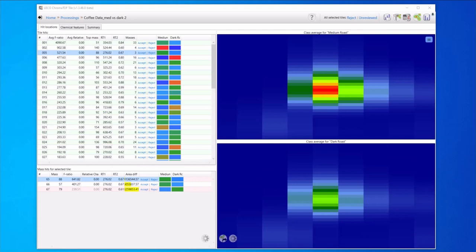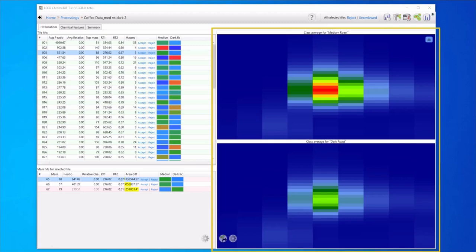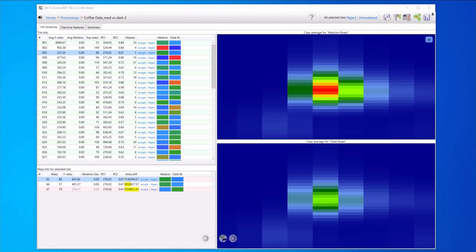After processing, the software points us to the locations in the chromatograms that have differences and meet all of the thresholds. This information is compiled for review here in the hit location window. In the top corner we see the locations of the chromatographic windows where there are differences. In the bottom corner we see the masses that differ for each of these chromatographic windows and on the right side we see an averaged contour plot for each of our sample classes. The medium roast is on top and the dark roast is on bottom. These views make it easy to review and interact with the data and to curate the chemical features. This can be done either manually or with the auto curation tools.